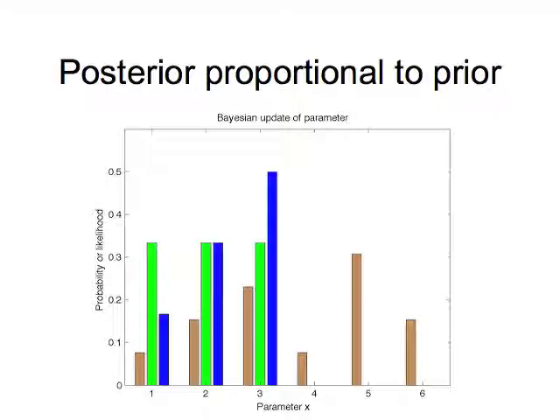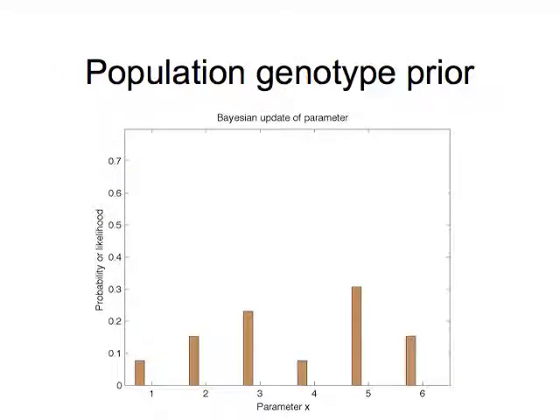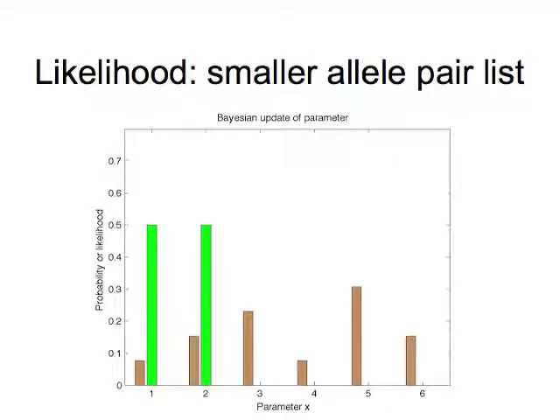So suppose, for example, that it's the first allele pair, shown here listed as 1, that corresponds to the suspect. When that allele pair is selected out and we look at the ratio of probability of the blue bar to the brown bar, we'll see a likelihood ratio of 2, which is the information contained in the data for that match.